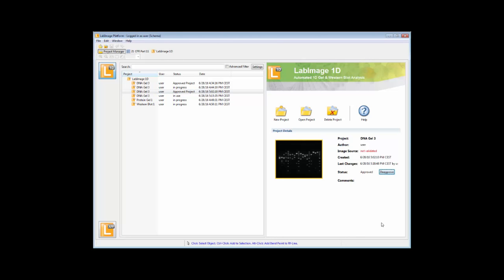There are even more options to choose from. LabImage can be installed as a single user system. This will mean that only a single user can access the database at the same time. Each user has a separate database, which is not very handy for maintenance and backup. More than one user can be managed in that mode. The installation mode is useful for single computer installations.